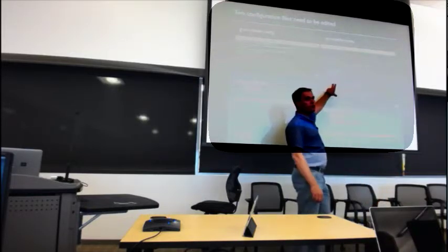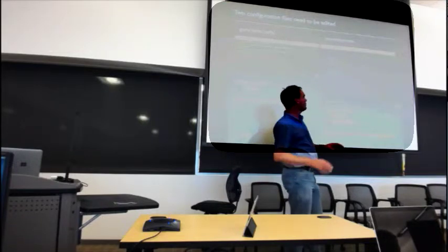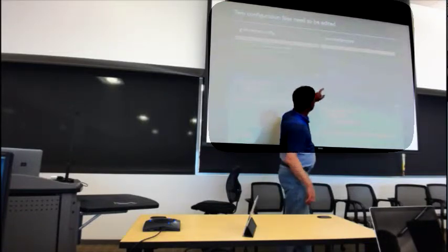This is actually just a script. You can launch it from the command line if you want to. It's process run number ini file tag. All the GUI does is call this script.